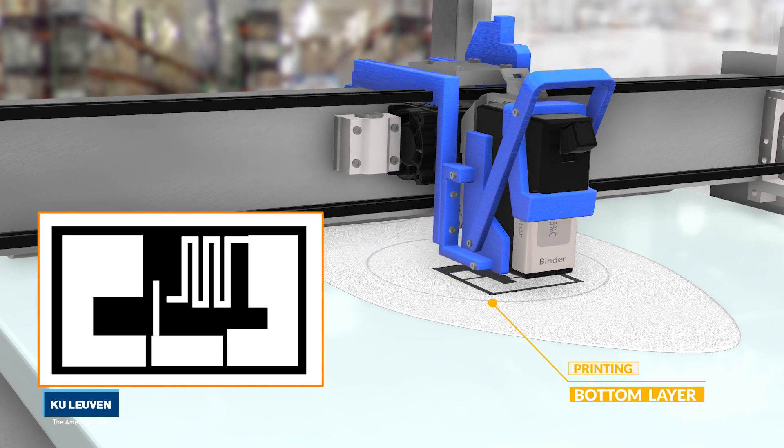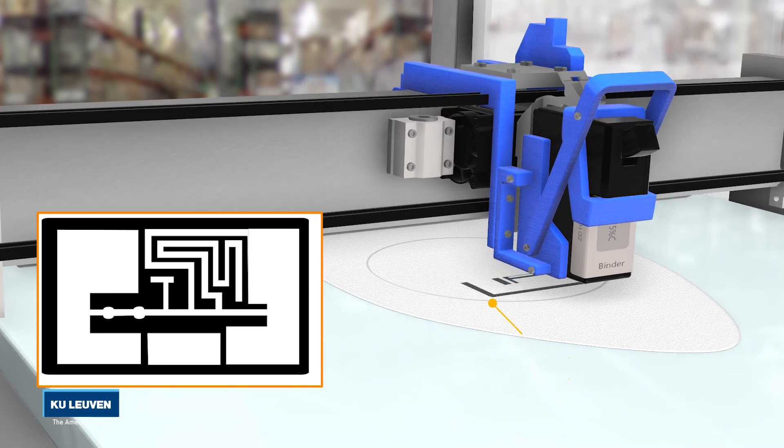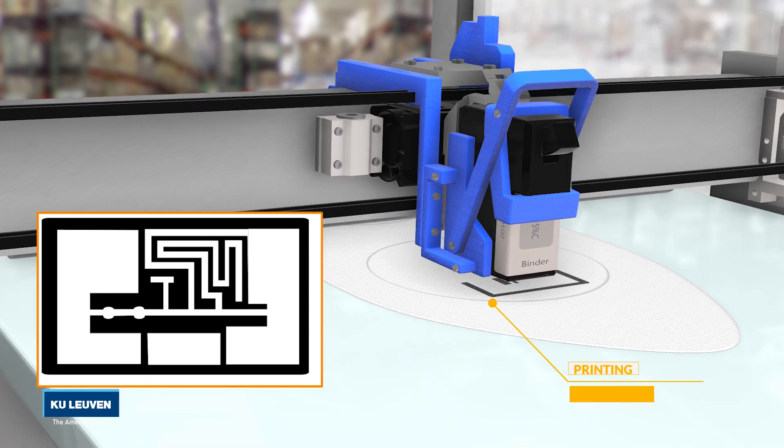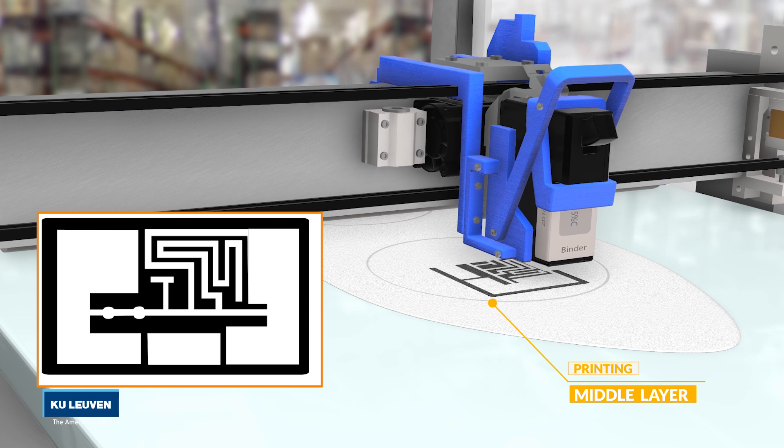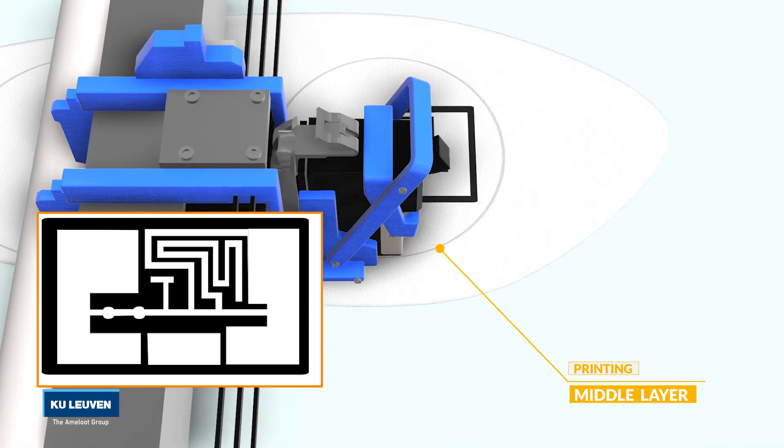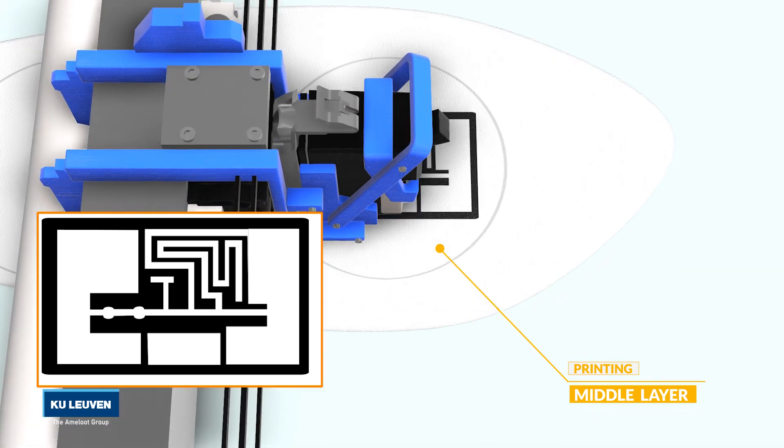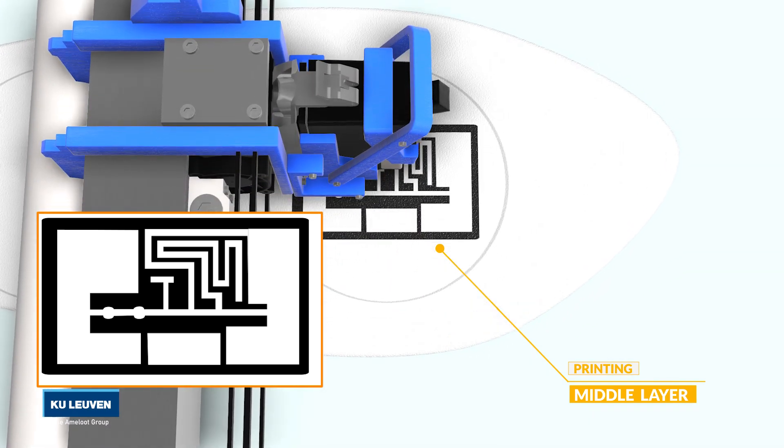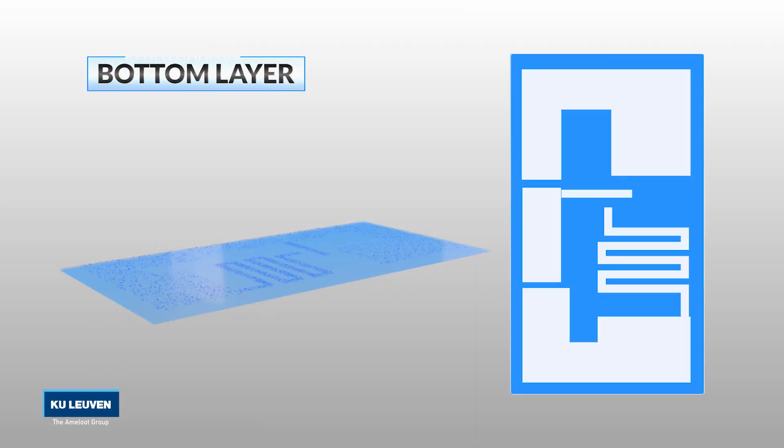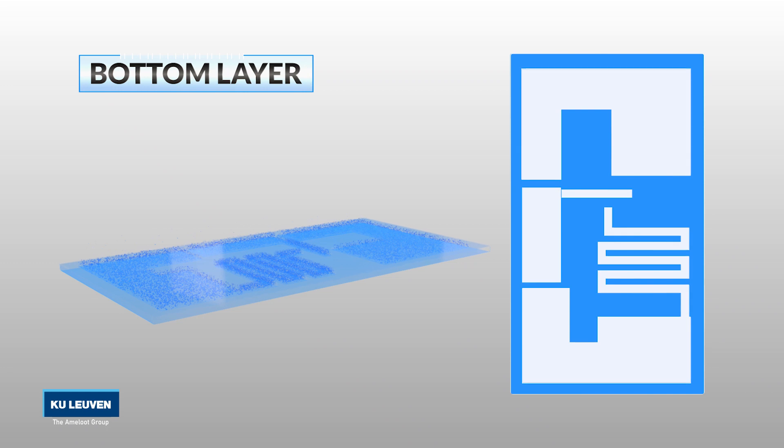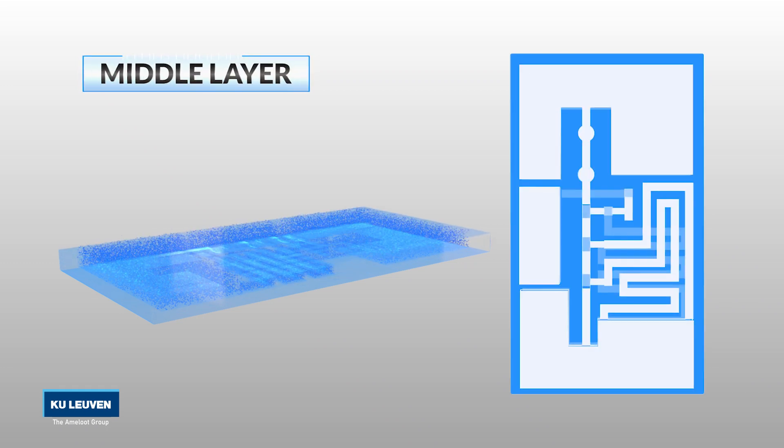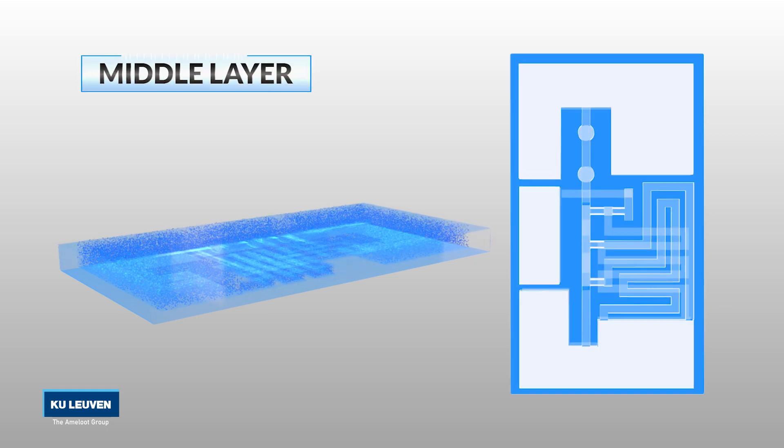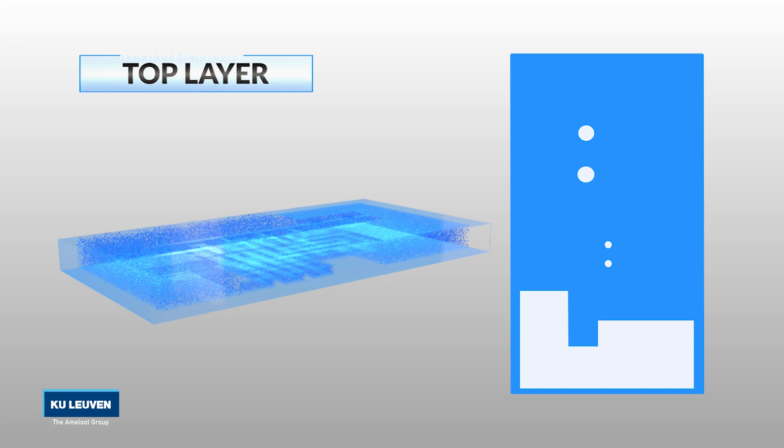The walls surrounding 3D channels for fluid handling are defined by printing a hydrophobic ink. Simultaneously, other reagents can be printed to define intricate structures and flow control elements.